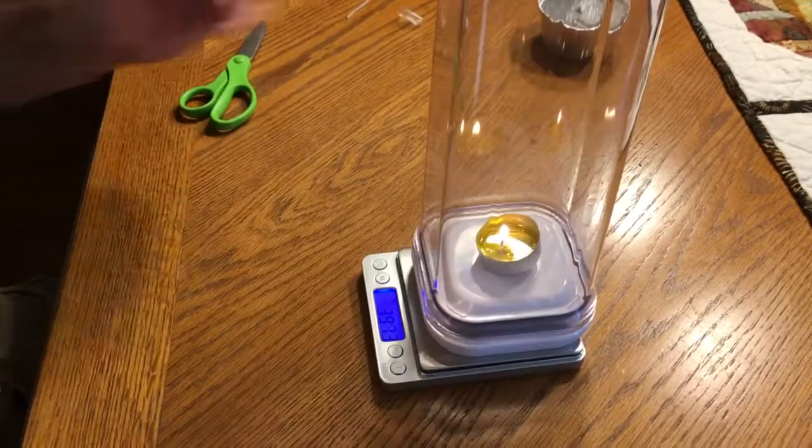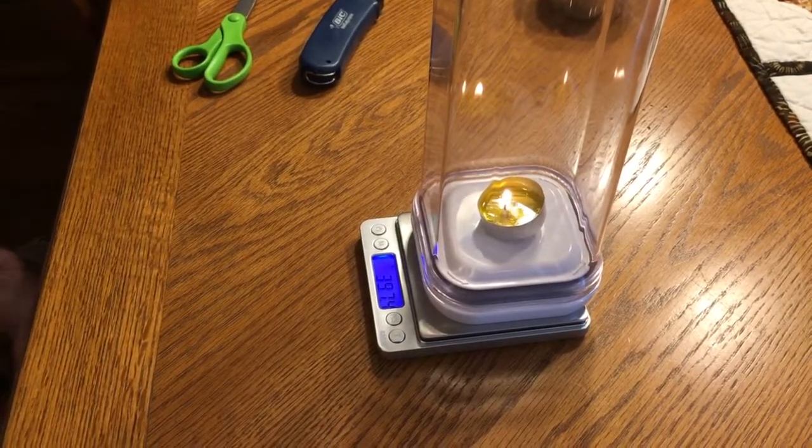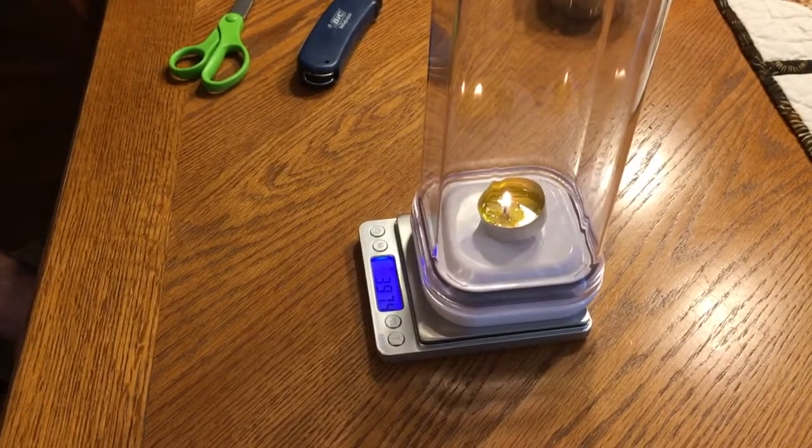Then you can put it on the scale and keep track of its mass. For the closed system burn, that mass shouldn't change.